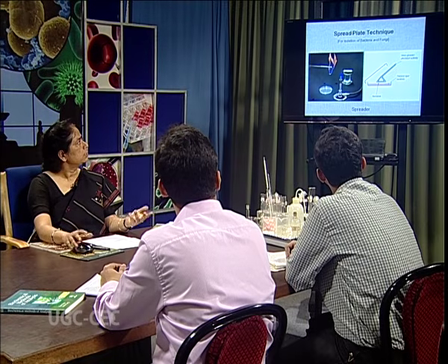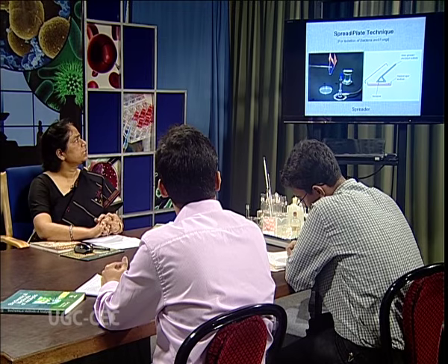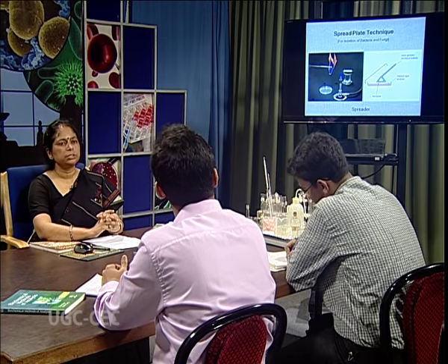In the environment or in natural form, the bacteria are always present in a mixed population, and we have to isolate those bacteria and prepare the pure culture of the bacteria. So, let us study what are the different methods of the preparation of the pure culture or isolation of the single colony. The first method, which is very commonly used for the isolation of the bacteria and fungi, is the spread plate technique.